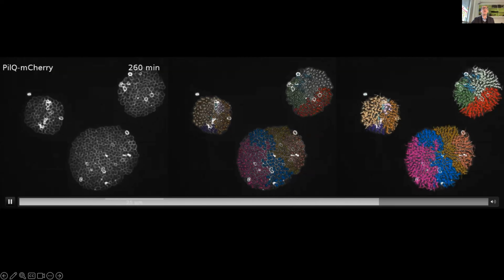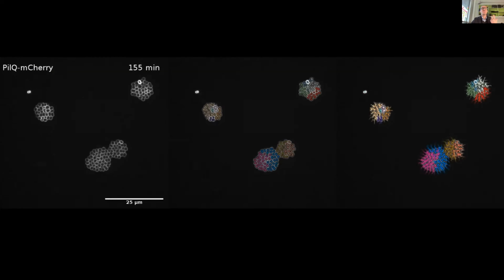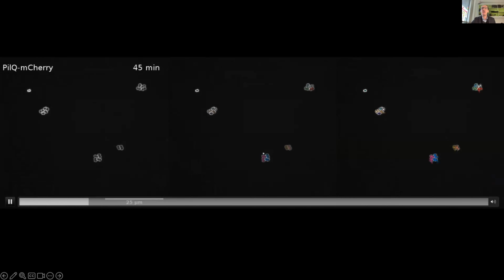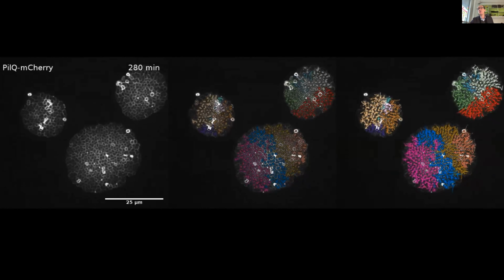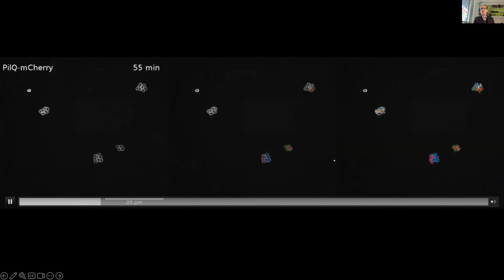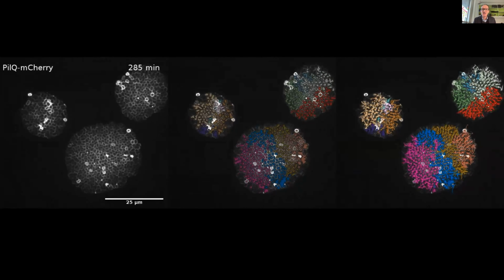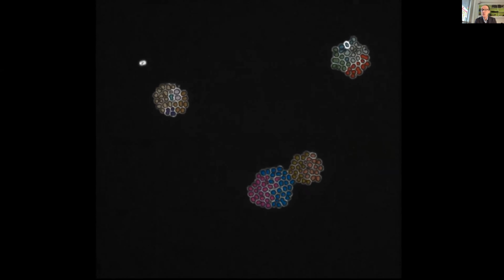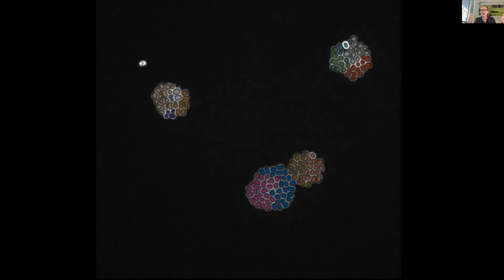When you start, for 4 or 5 bacteria, you see that they grow at a speed which is quite impressive. You can segment them, individual ones, and from the segmentation, you can apply tracking algorithms that will be able to recognize cell divisions and actually identify the clusters or the colonies of the bacteria. And there's a breadth of information in this movie, which I find incredible. Because you have access to the dynamic of growth, you have the mother bacteria that divide successively. So you have the hierarchy, the lineage of the cells.